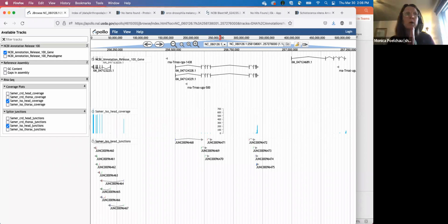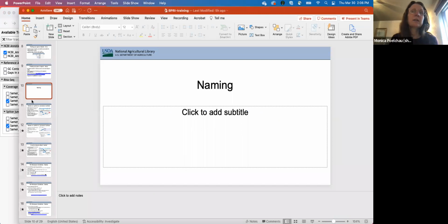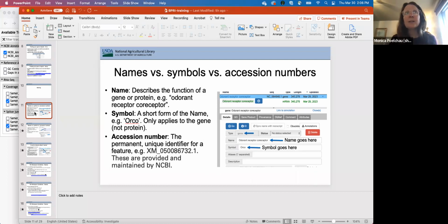Okay, so naming. And this sort of goes along the same question that was just phrased there, like, what's your end goal? As I said before, I want to devote some time to naming because I've seen a lot happen in terms of names, a lot of creative naming in Apollo. People get kind of excited about that.